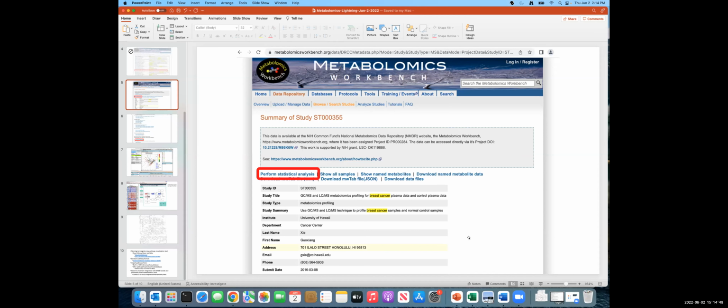We pull data regularly from the Metabolomics Workbench via an API, kindly provided by Shankar and Owen. Then after we've completed our analysis, MWB then incorporates pointers to our analysis for the analyzed studies. If you want to find Metabolomics Omic browser, one way to do that is to go to the Metabolomics Workbench study page and click on statistical analyses.